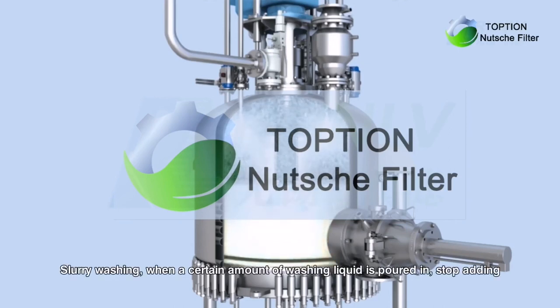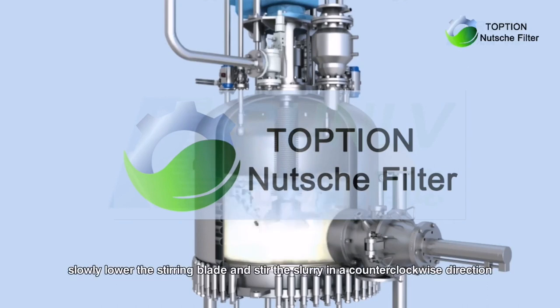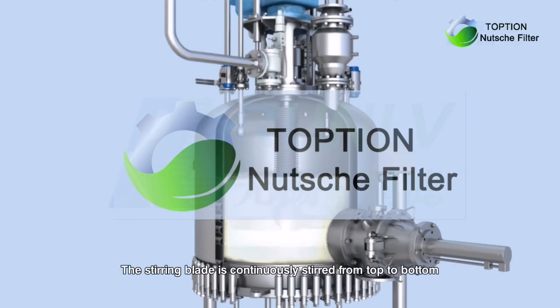Slurry washing: when a certain amount of washing liquid is poured in, stop adding. Slowly lower the stirring blade and stir the slurry in a counterclockwise direction. The stirring blade is continuously stirred from top to bottom.